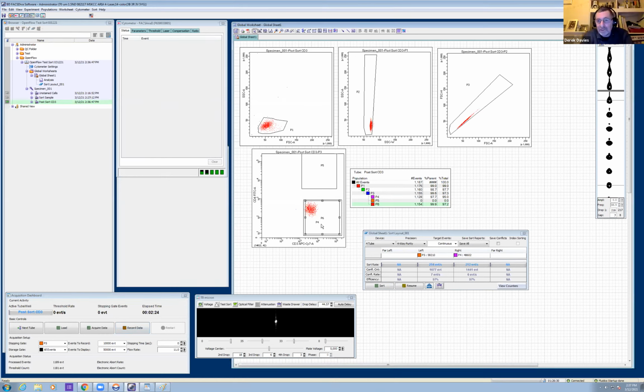You could potentially, if they're fragile, decrease the viability as well. There are ways of counting reasonably dilute cells. Flow cytometers are very good at counting if you've got a volumetric flow cytometer, but I would try not to do any manipulation at all, because you do run the risk of losing cells. Right, very important. You just take an aliquot and count the cells, and that's it.